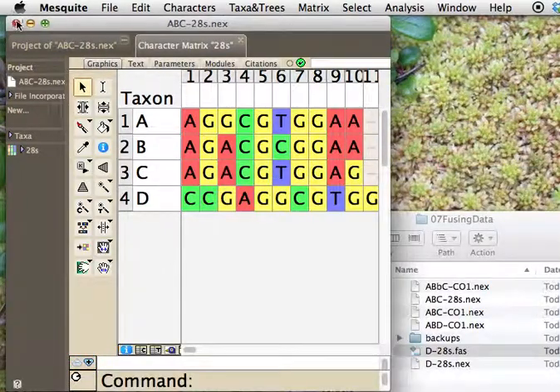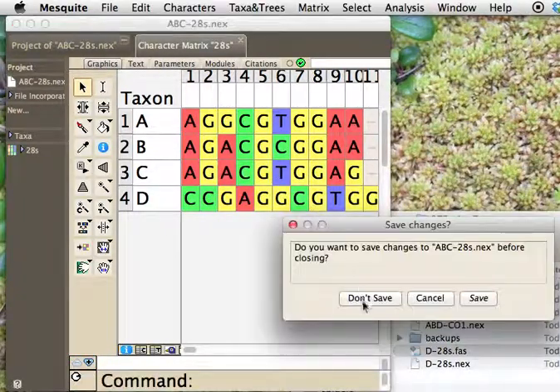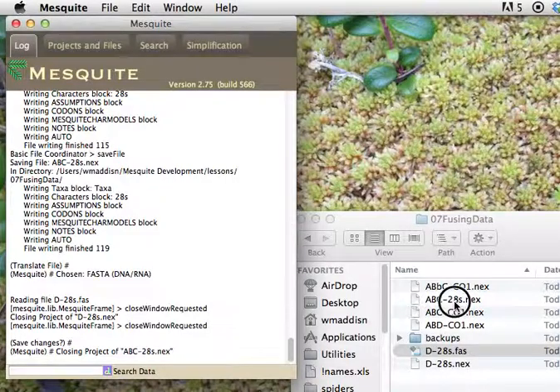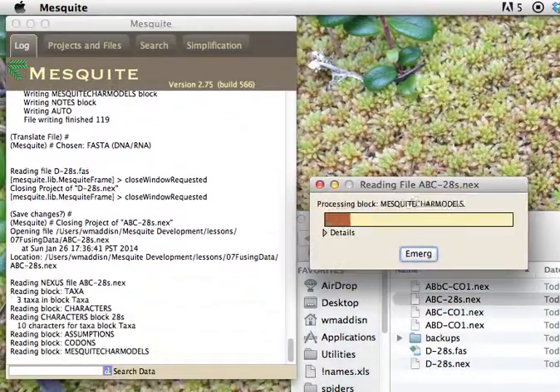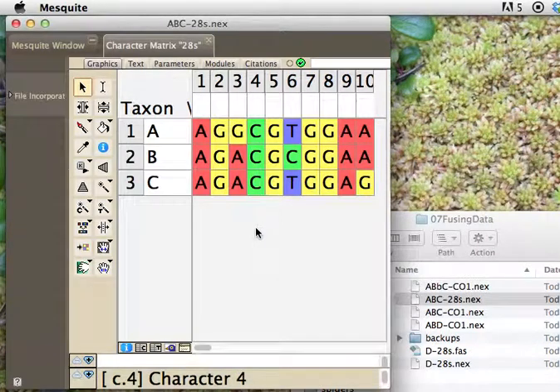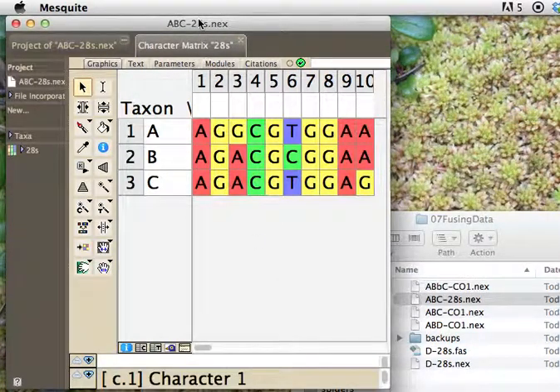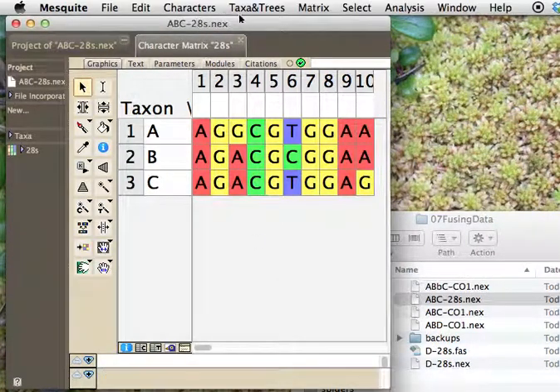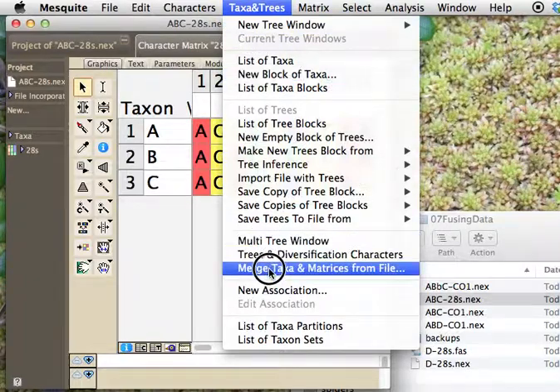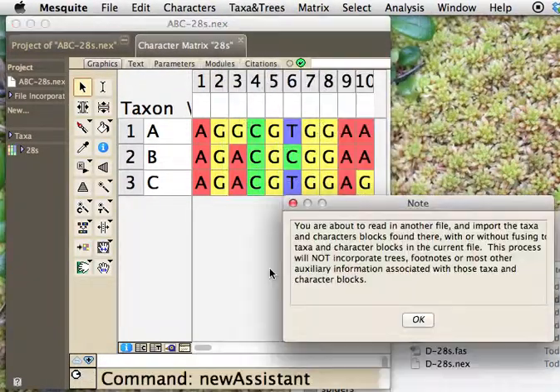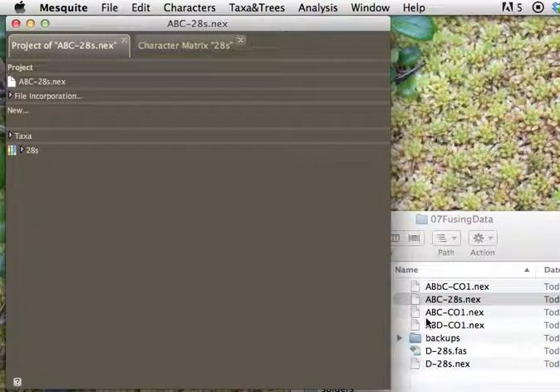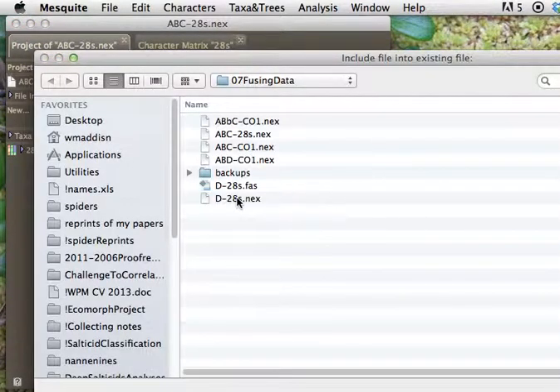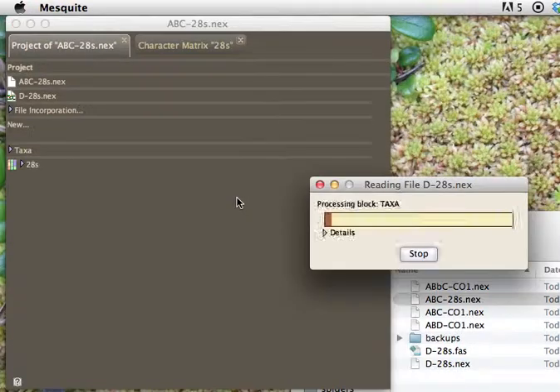There's another way to do it, though, and I'm just going to start again. I'm just going to say goodbye, and we're just going to start this up again, get back to this file. Another way to do it is with a special function called merge taxa and matrices from file, and it's right here under the taxa and trees menu, and it gives you a little bit of instructions. What it does is that it basically gives you the option to open up a file, so we're going to open this one.